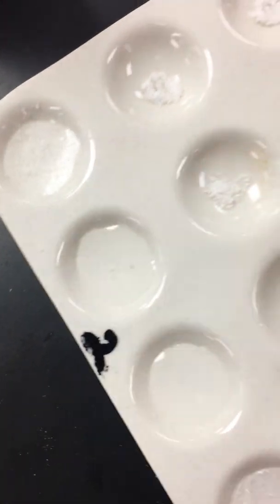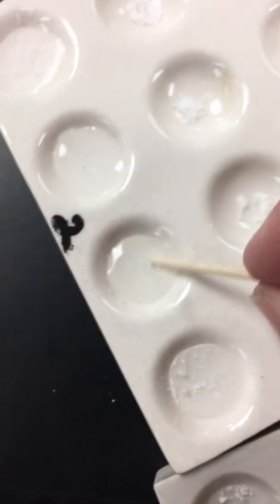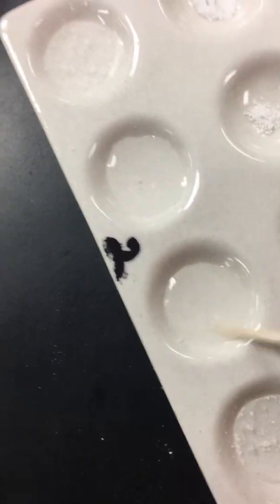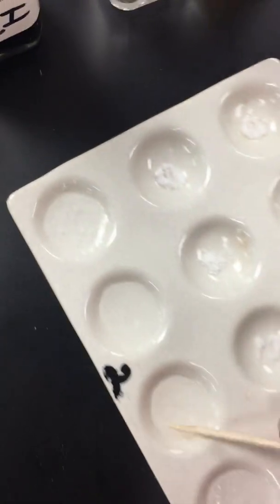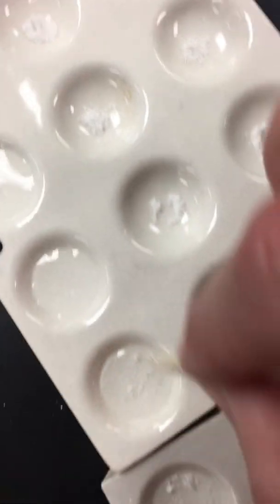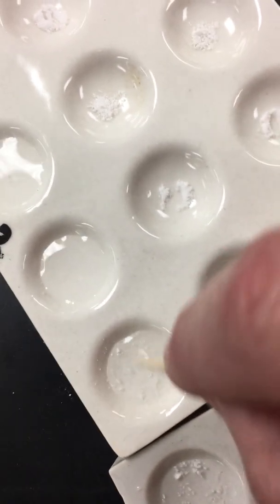It's already dissolved. All right, next is sodium bicarbonate. It also dissolved, or at least mostly. And then we have acetaminophen, which is kind of floating on top, not really dissolving very much.